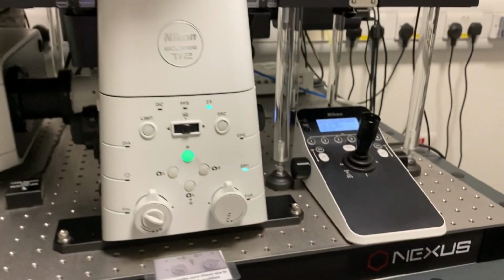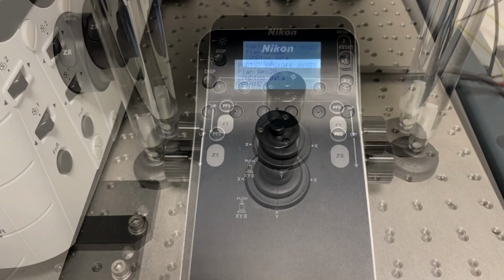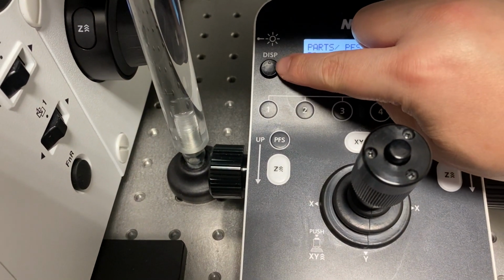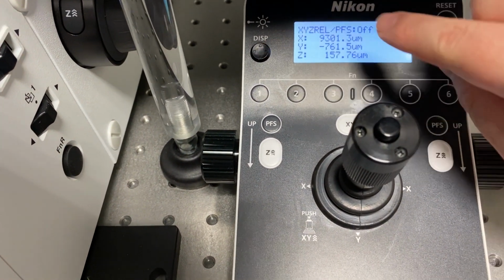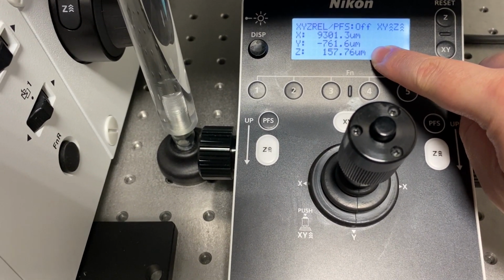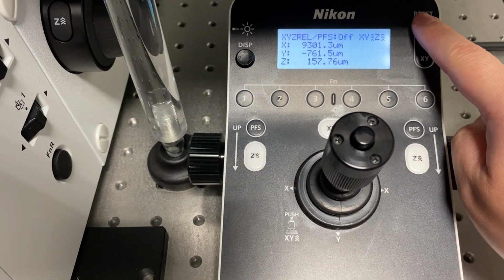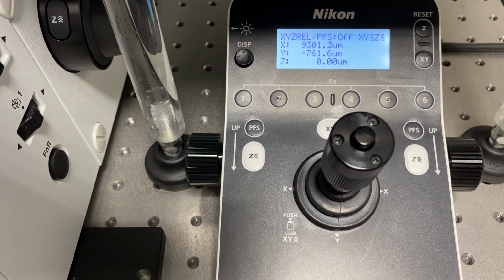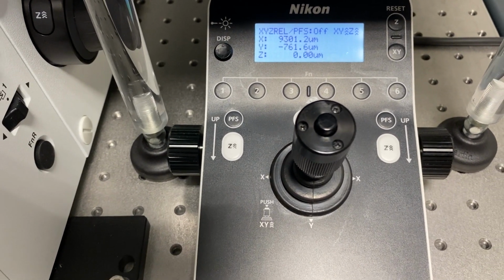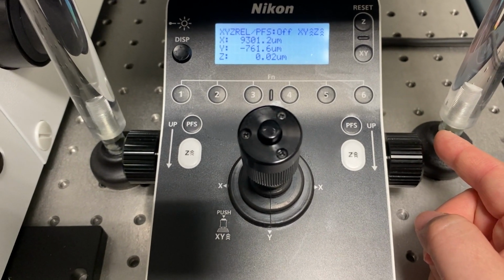And to do that, all the controls you need are on here. First, you need to change the display by pressing this little arrow. And now you can see the height of your lens. The number itself doesn't matter too much because you can reset that number anywhere, and it doesn't affect the actual height of your lens. But this number does tell you whether you're going up or down.